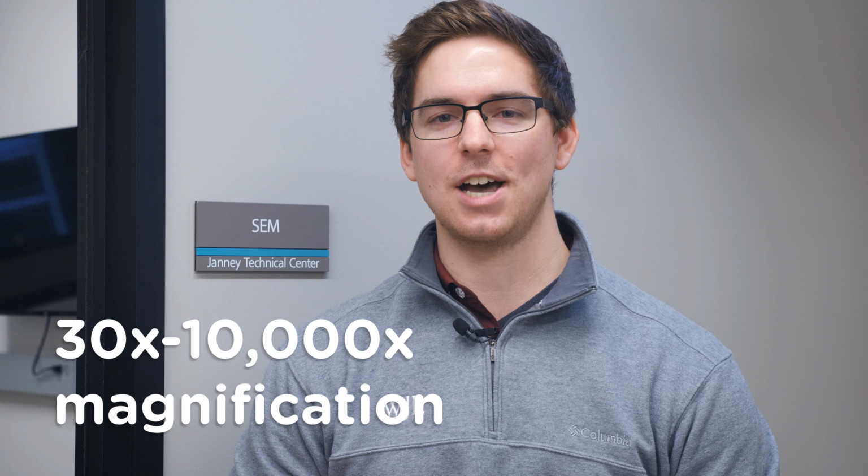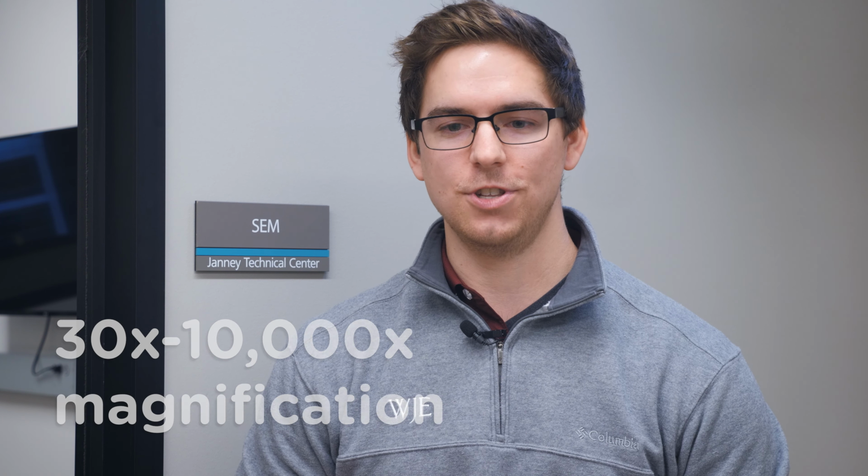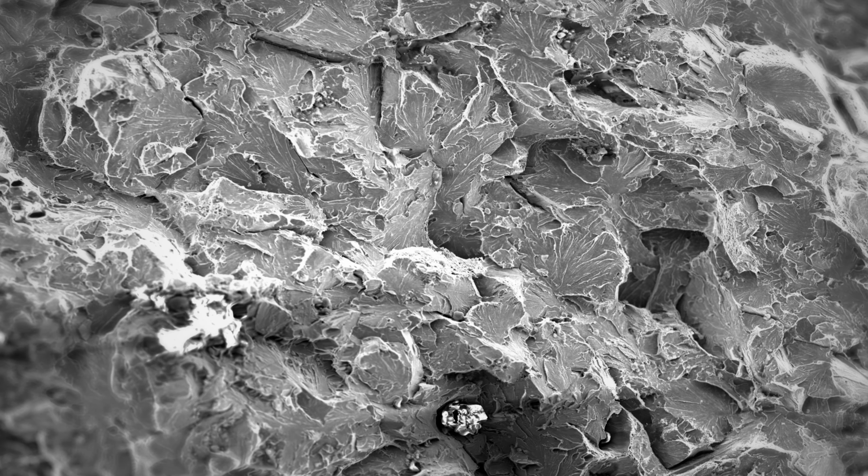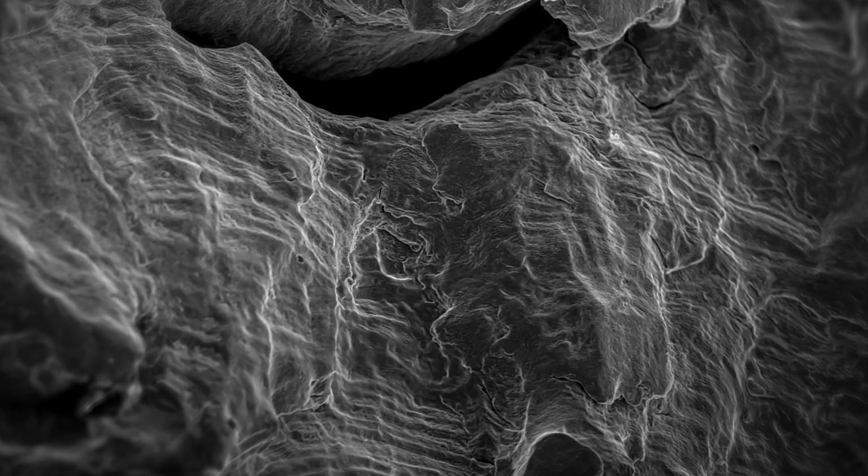This particular unit is capable of magnifications ranging from 30x up to 10,000 times magnification. So this high magnification use of the scanning electron microscope is particularly useful for me as a metallurgist in characterizing metal fracture features such as identifying fatigue in a sample.